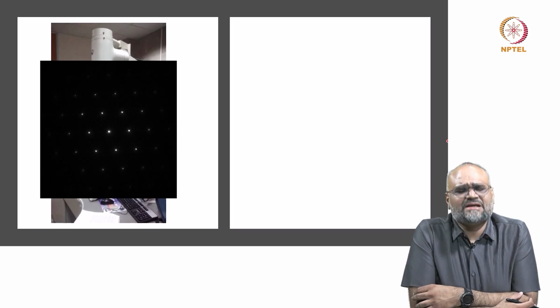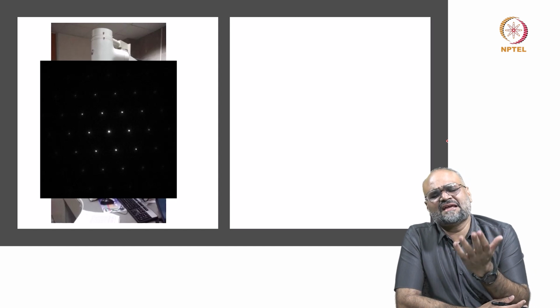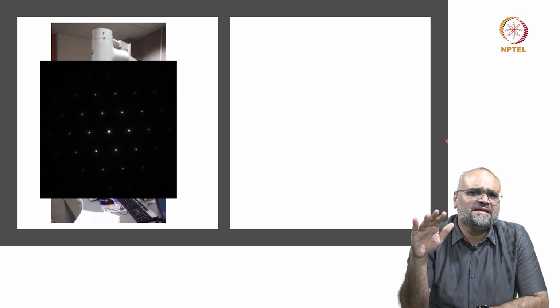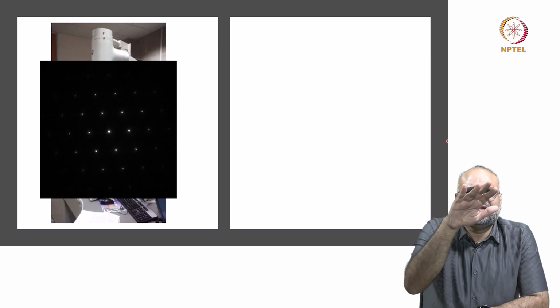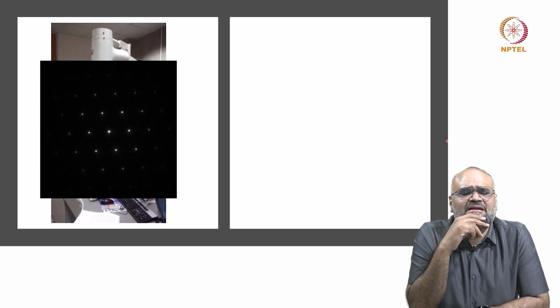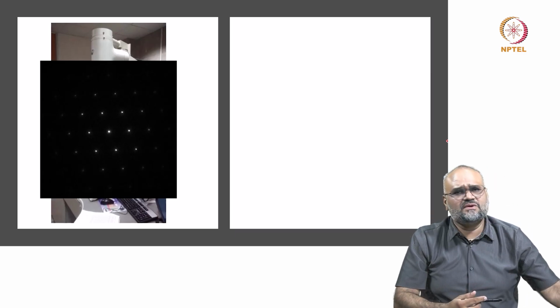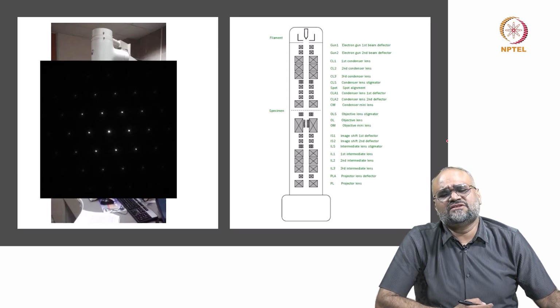So, what you are doing is, by using this HT wobbler, you are seeing, as a function of the change in the lens currents, how the image is moving. You should ensure that the image distortion is not random in any direction in the XY plane, but it remains more or less in and out of plane along the Z axis. And once you correct for these, what you should then do is start imaging in the high resolution mode.